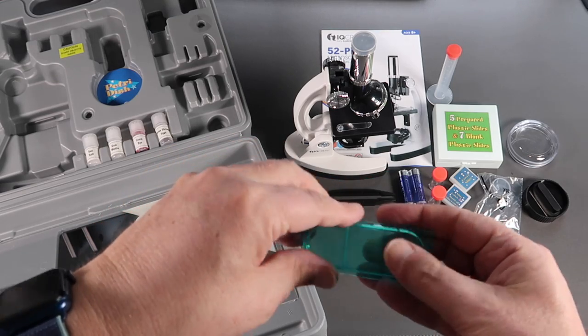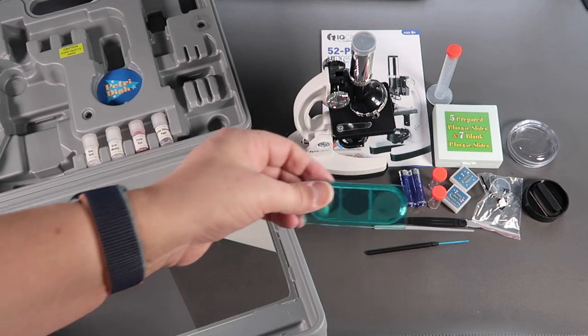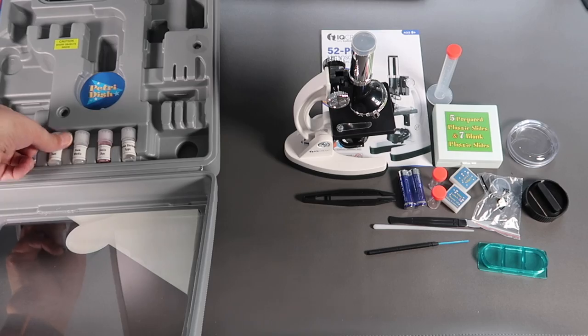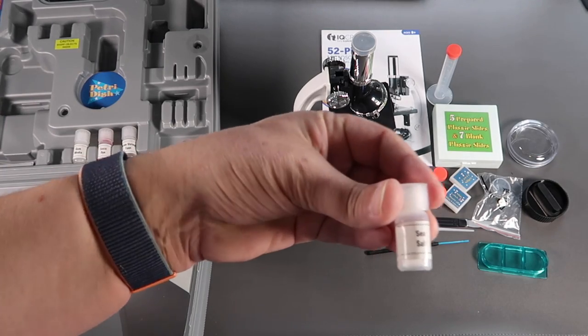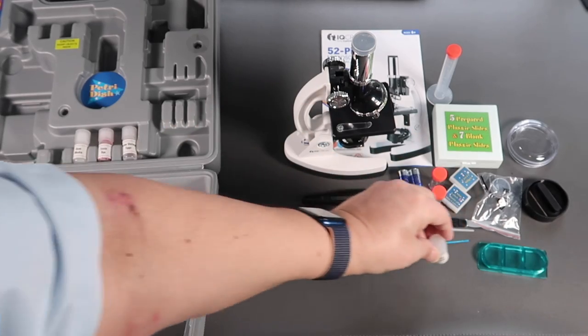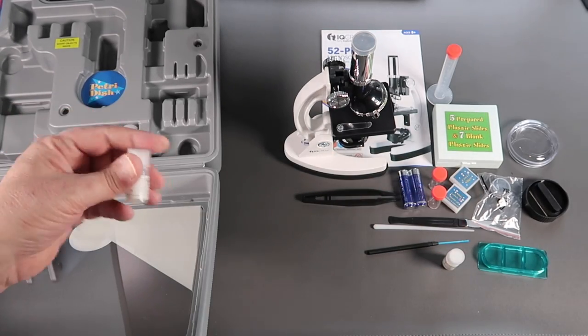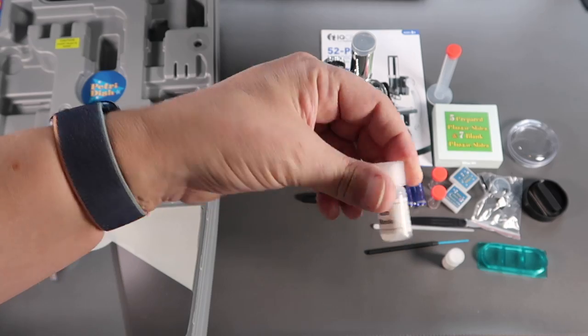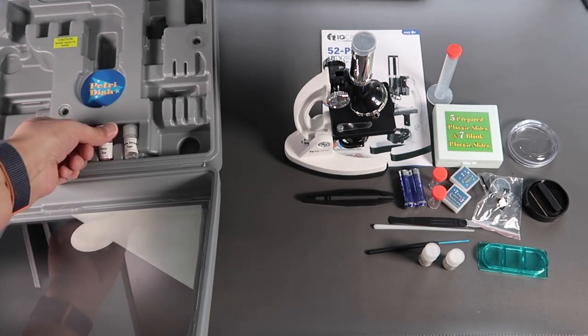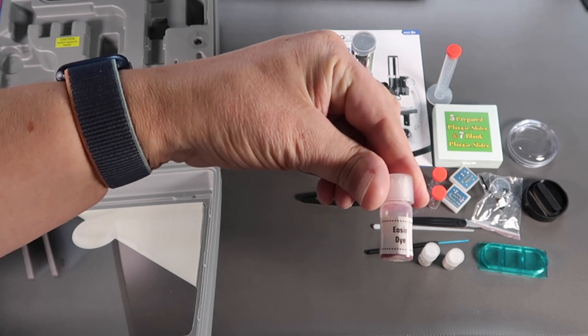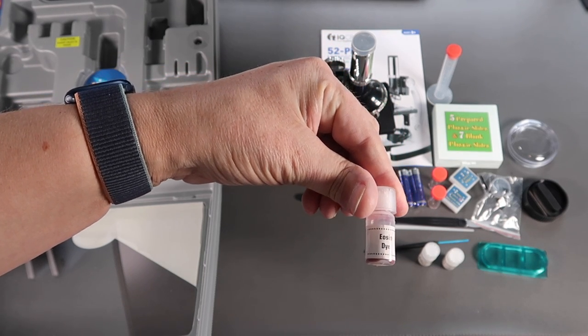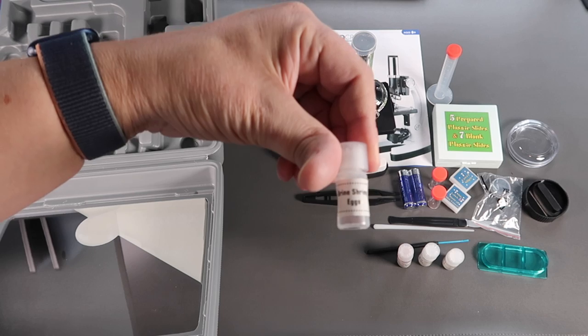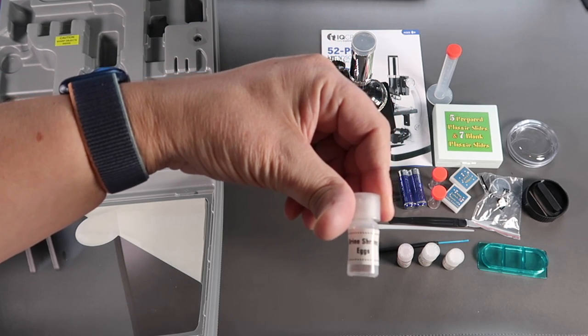This is a brine shrimp hatchery. Very interesting. And then finally we have some ingredients. Sea salt. Gum media. Eosin dye. And brine shrimp eggs for the hatchery.